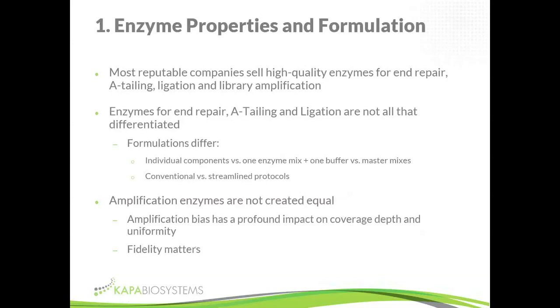In the old days when we all learned to do PCR, the focus was mostly on amplifying a single thing. We wanted to get a 500 base pair fragment of the GAPDH gene or something, and we could carefully optimize primer sequences and everything else to get the most out of our enzyme for that specific target. But remember that libraries are mixed populations of molecules.